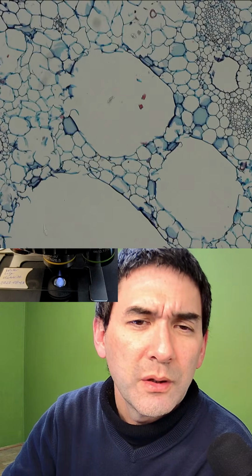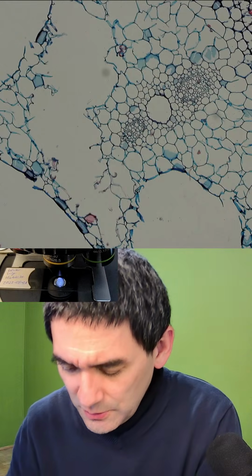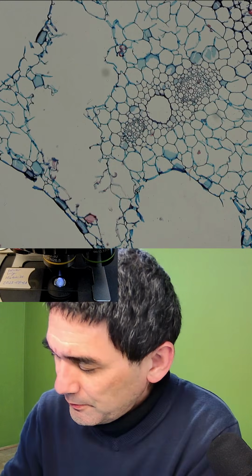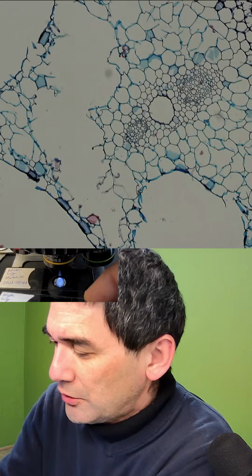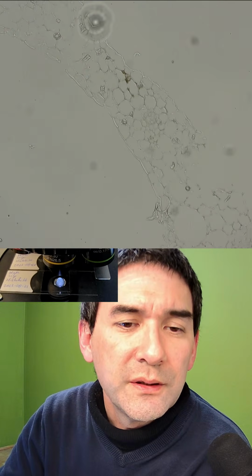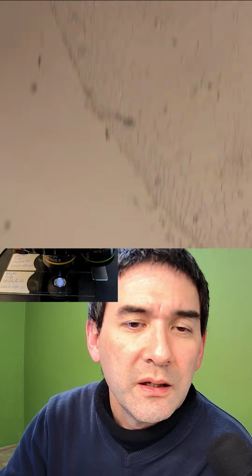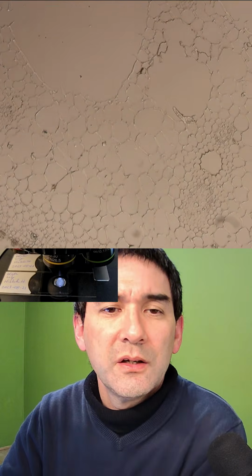Oh, come on, where are they? There was another one. Maybe it was on the other slide, I don't know. Let me quickly check. This one is cut much thinner. Yeah, he cut them at different, how do you say, thicknesses. Maybe they're easy to see. Yeah, so I got three slides of the water lily. Oh gee, here's another one.